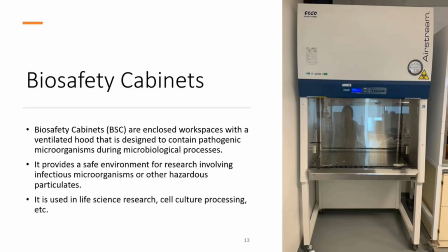Next, biosafety cabinets. This is a picture taken at one of the microbial labs in our school. As we can see, it looks a bit similar to the chemical fume hood. It also offers an enclosed workspace with a shield between the internal environment and the user. However, the function is quite different from a fume hood. We have learned just now, right? A chemical fume hood is used to handle the hazardous chemicals.